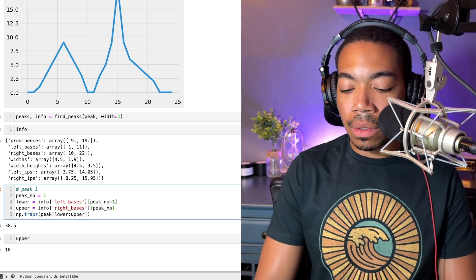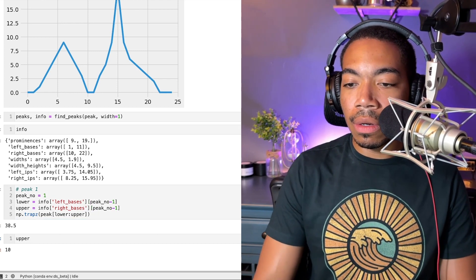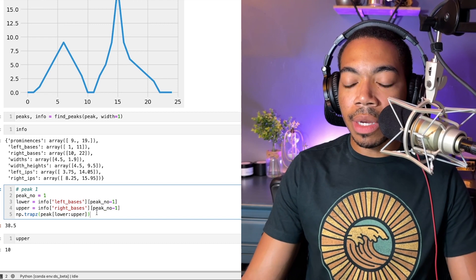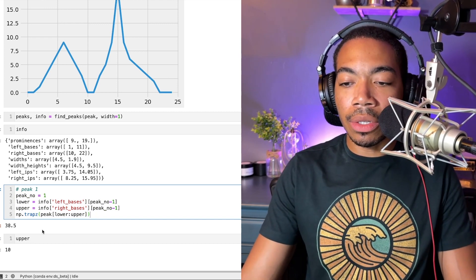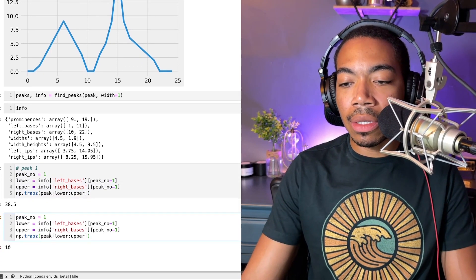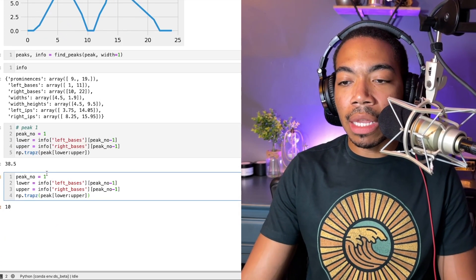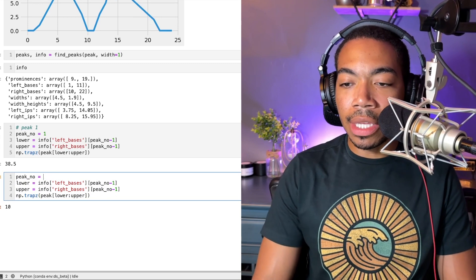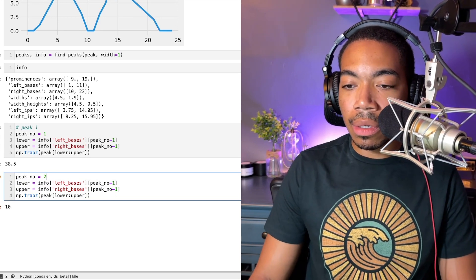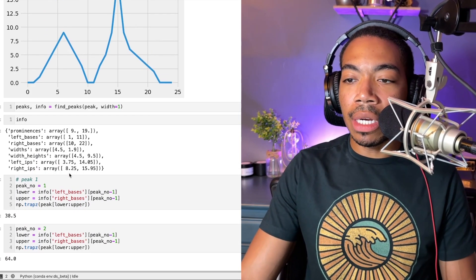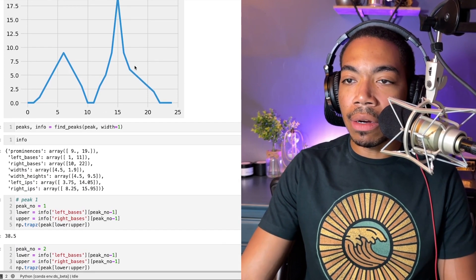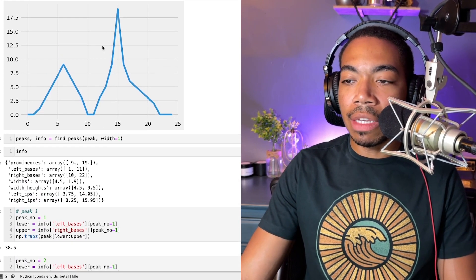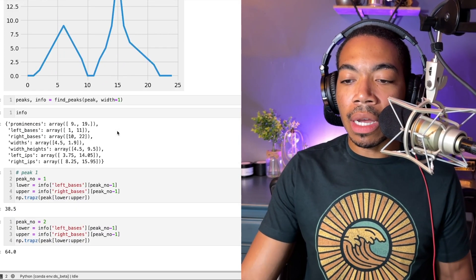We'll do the same thing here. For peak two, I'll copy this here just so you can see how easy we can replicate this, but in reality we simply just update this peak number. You see now we're integrating this second peak here, which is significantly taller.